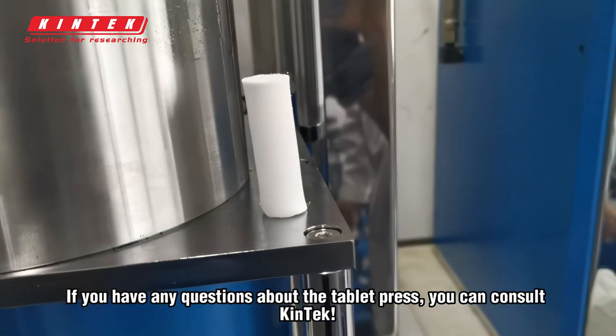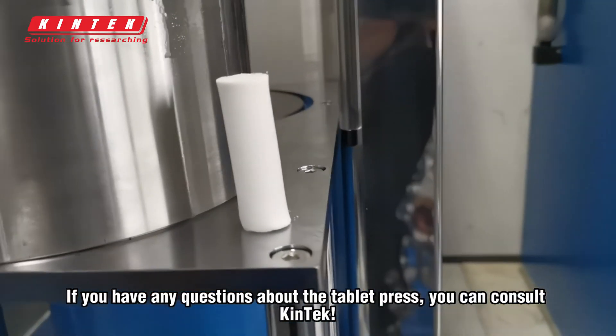If you have any questions about the tablet press, you can consult KinTek. Thank you.